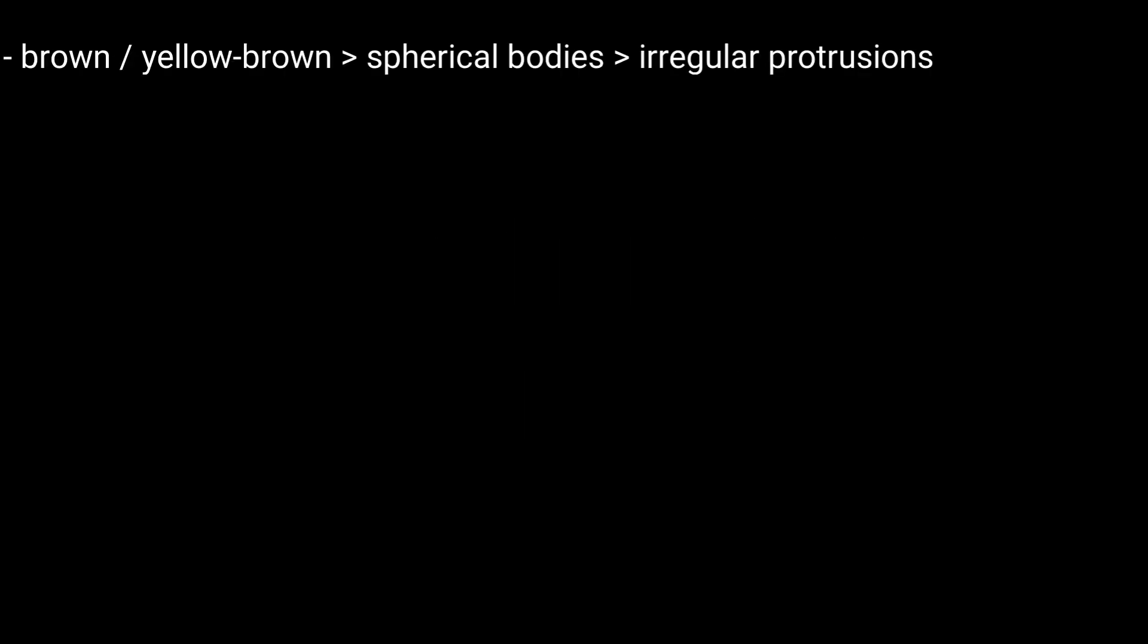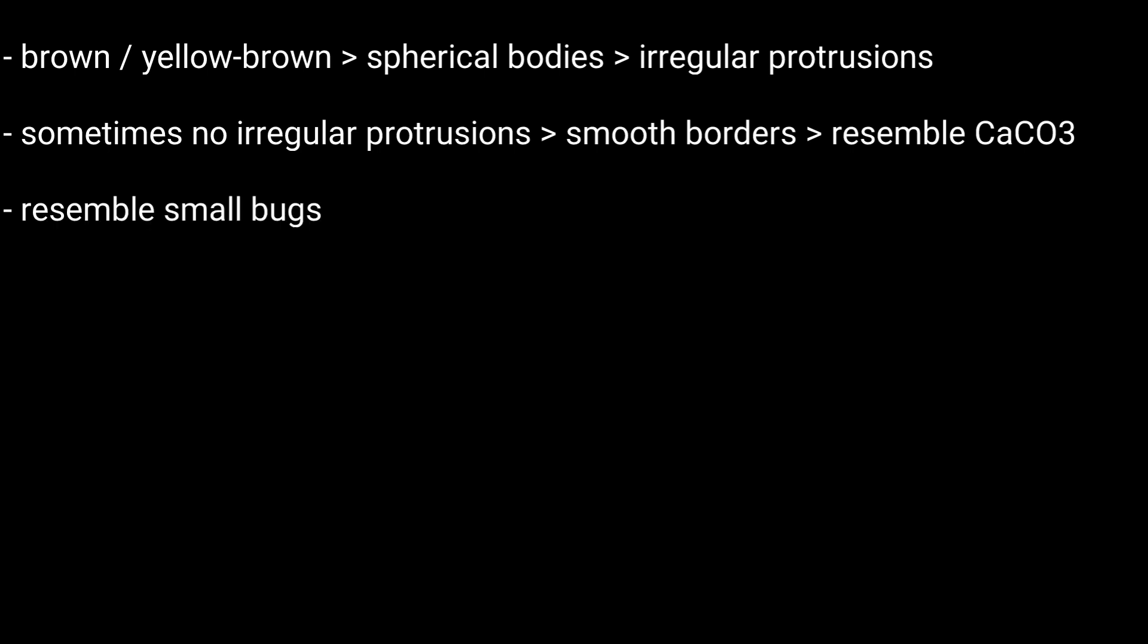Ammonium urate crystals generally appear as brown or yellow-brown spherical bodies with irregular protrusions or spiky horns. In some urine samples, they do not have irregular protrusions but have smooth borders and can resemble calcium carbonate. They almost resemble small bugs.